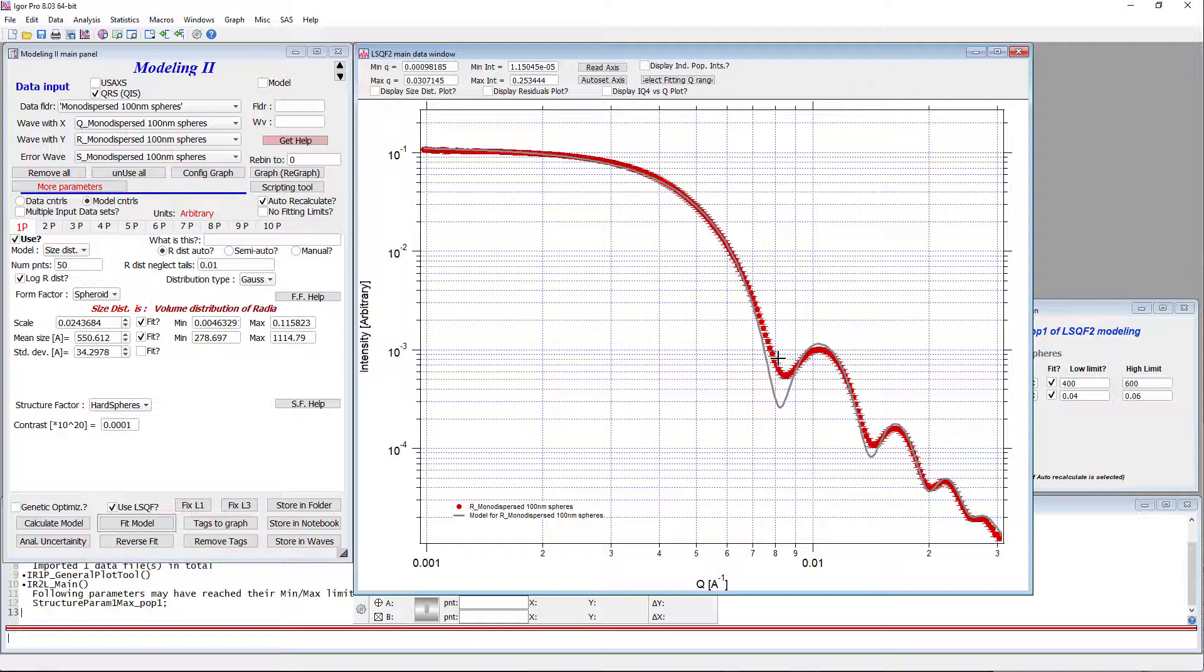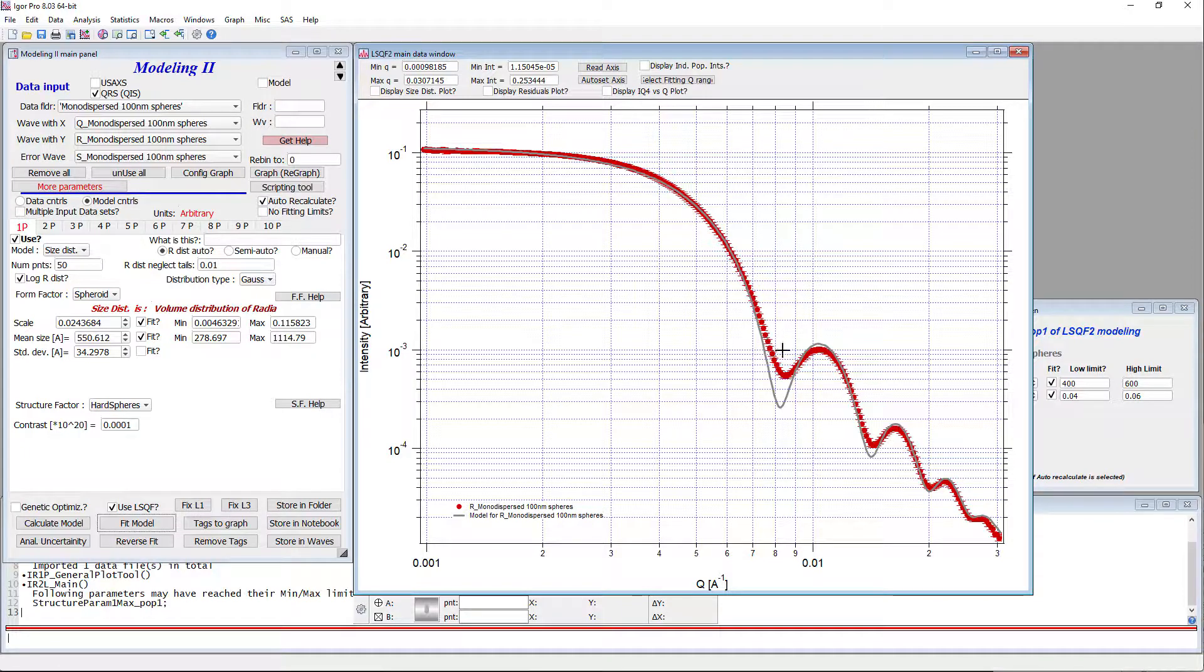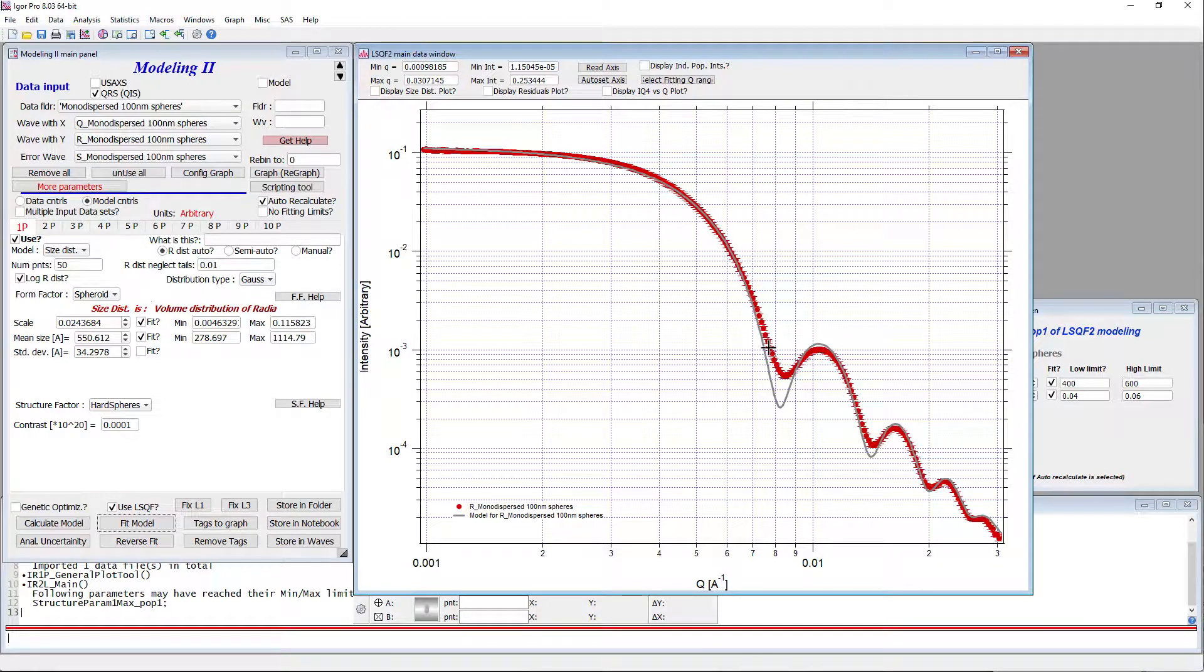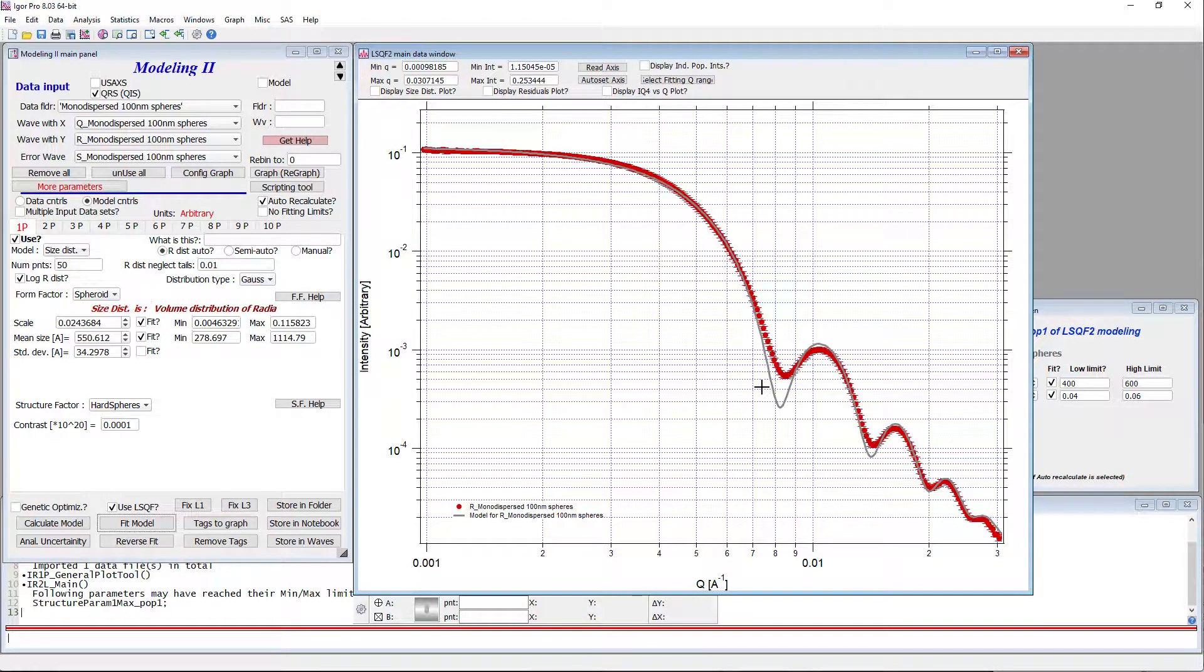It took me some time and discussion with the owners of the data. In this case, even though they have very, very nice, dense points on the detector, and the detector has relatively small pixels, the beam size which is used to measure this data is actually relatively large. We worked out a bit on what the data of the width of the beam on the detector is. And with some hand-waving, we figured out that actually the Q resolution, in other words the width which is included in every one of these points, is at least 0.001, if not slightly more than that.